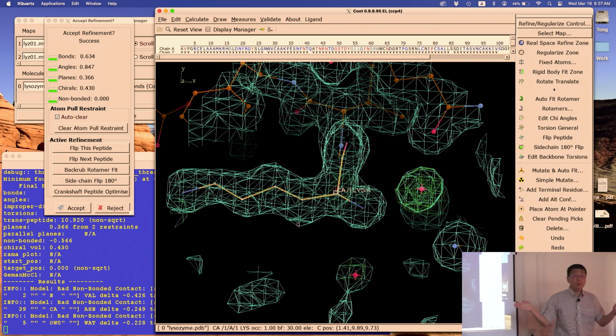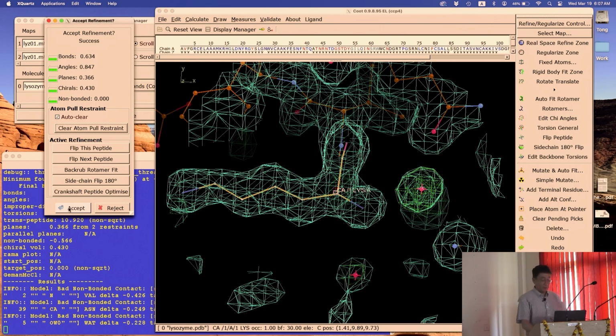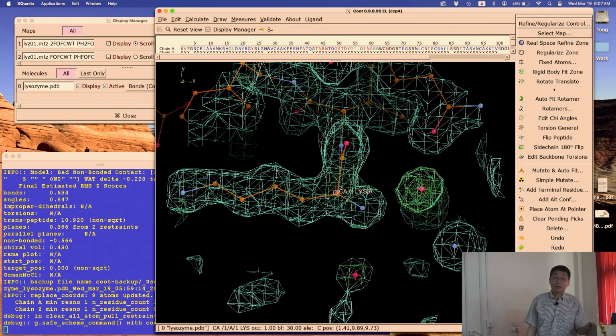So we're all happy with what you have? All right, better say accept. So that way you accepted this model. You're good? All right, congratulations, pat yourself on the back. You built the first residue. So I think we're done. Okay? So that's what we do. And we'll do a couple more, just for fun, okay?